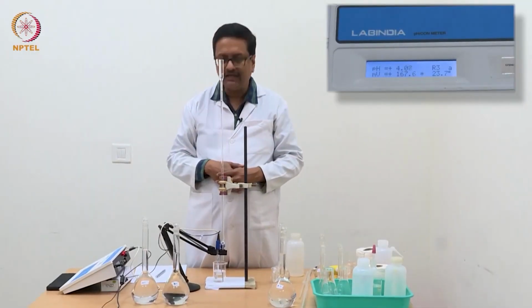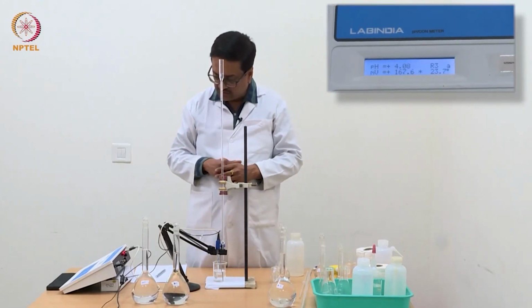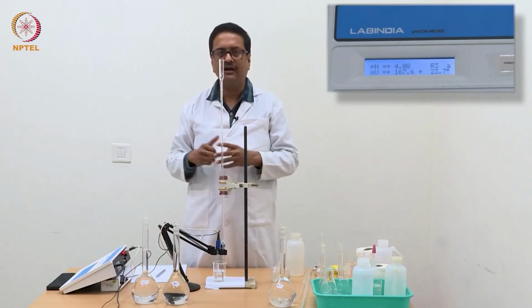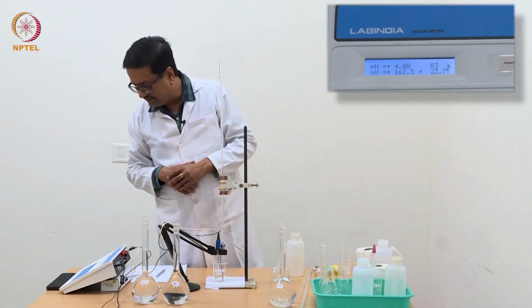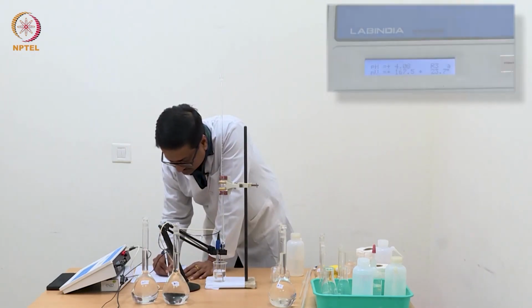Gradually I have added 0.02 ml in each step, and now I have reached 0.2 ml of NaOH, and the current pH that you can see is 4.08.